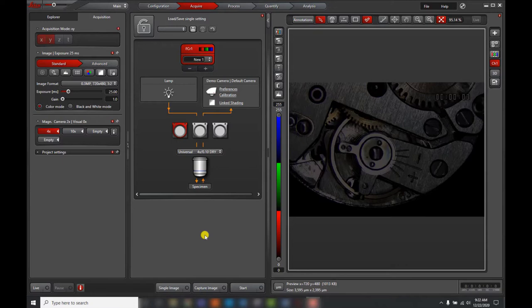That said, LASX software supports many microscopes, including our fully motorized platforms, and the default interface when you install this software includes features that are at times not applicable for manual operation. For example, the default interface includes a channel selection region in the middle of the software, which is primarily designed to help with multi-channel imaging, such as fluorescence.